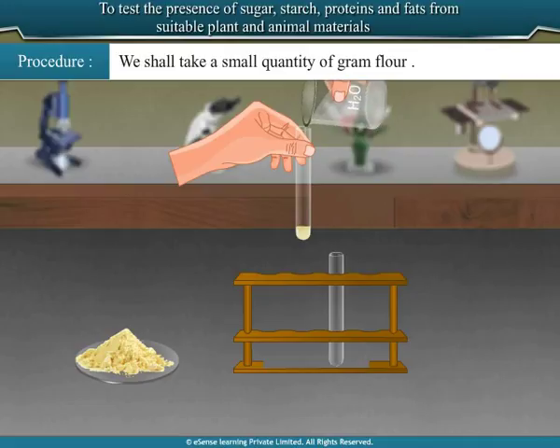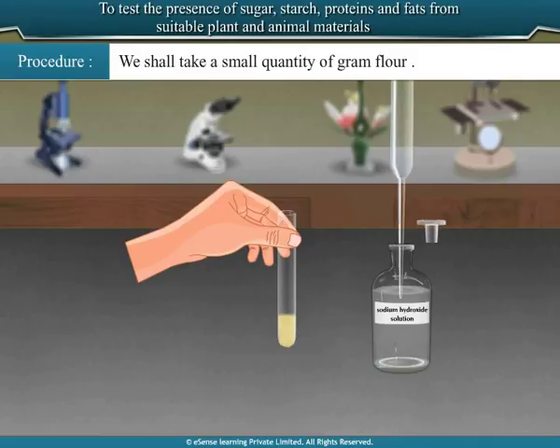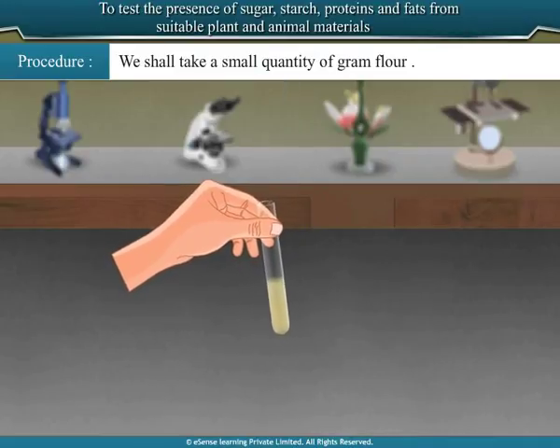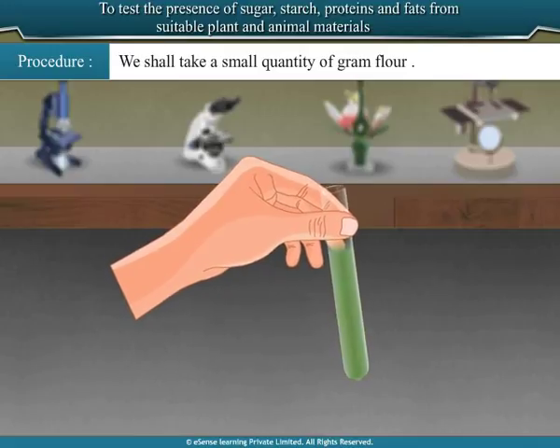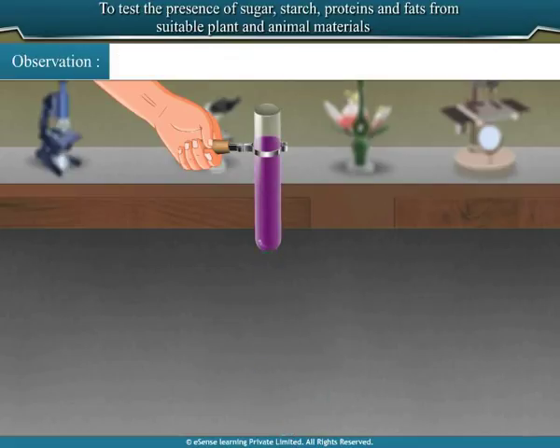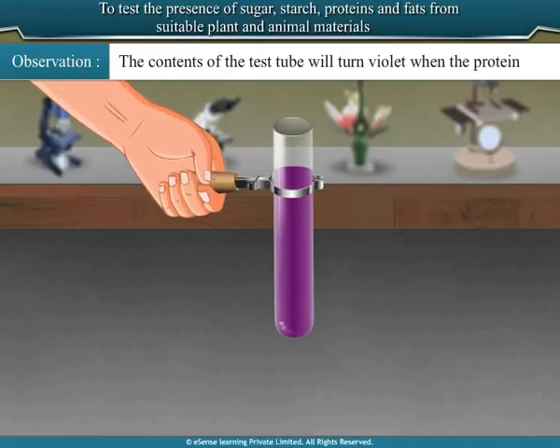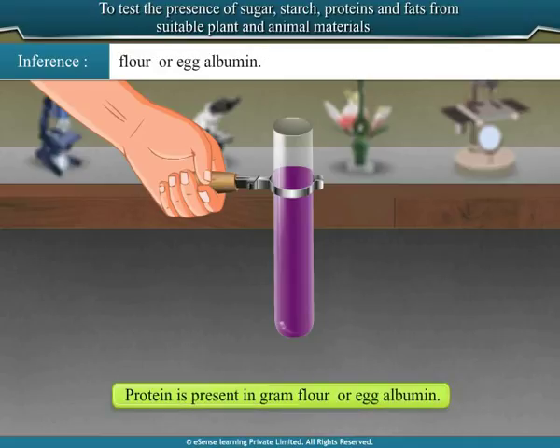Add 2 ml of water to the contents in the test tube and shake it well. Now add 2 ml of sodium hydroxide solution and mix well. Then add a few drops of copper sulfate solution to the same test tube. Boil the contents for some time and then cool it. Observation: The contents of the test tube will turn violet when protein is present. Inference: The positive test confirms the presence of protein in gram flour or egg albumin.